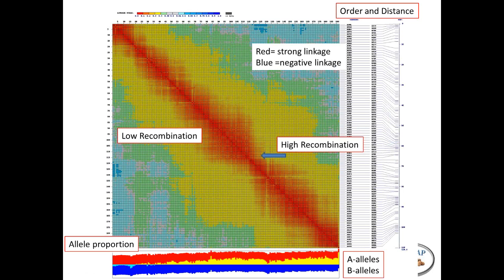And this is exactly what you see for Check Matrix for a single group. There's a lot of information here which allows you to see thousands of markers in one look. What Check Matrix is doing is aligning all markers by all markers, and it's asking the question, are they genetically linked? Basically, what you want to see is a nice red line down the middle over here.